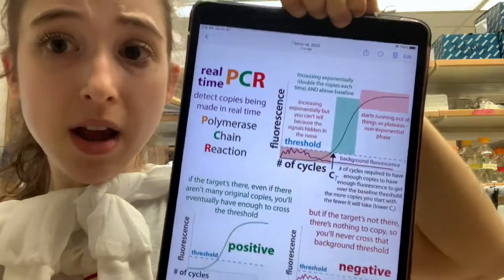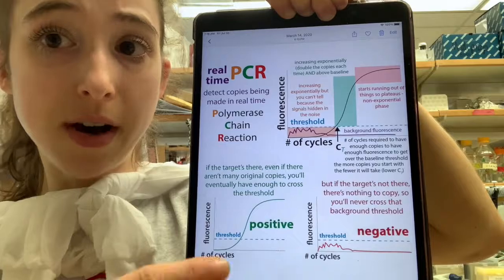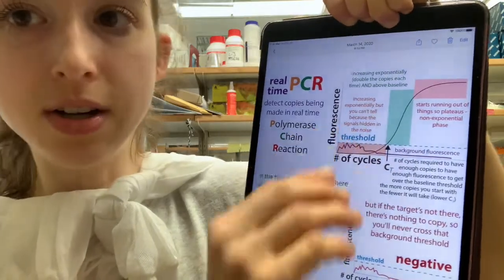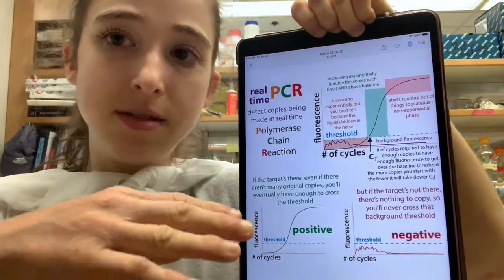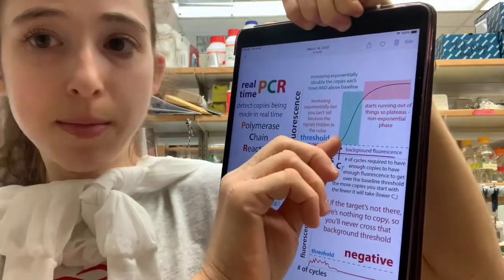But if you have a lot of the viral DNA, or the DNA copies of the viral RNA, so if you start off with a lot, you're going to quickly reach this exponential phase, because you get a head start. You start with it naturally high, and so you're already partway along the curve.